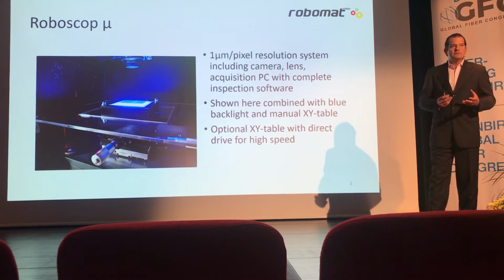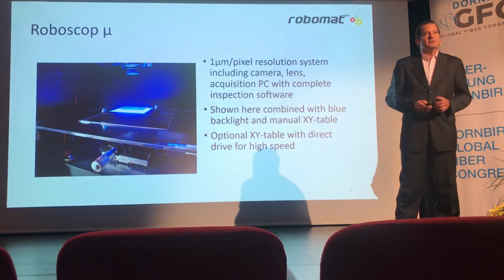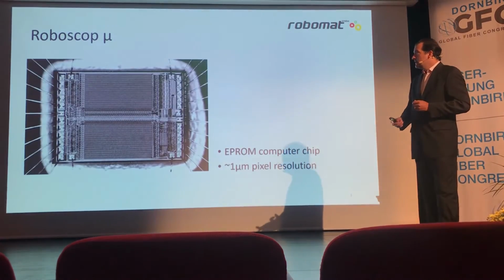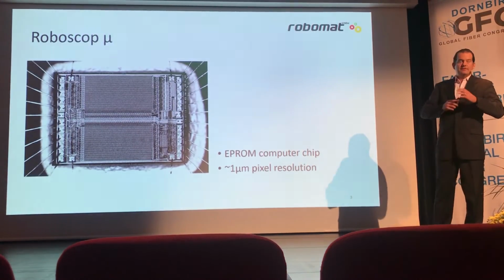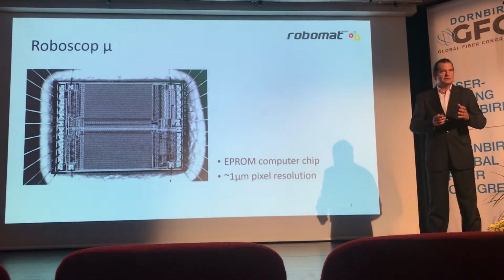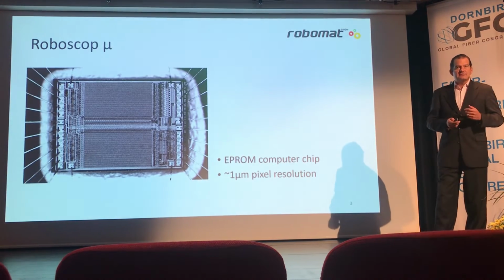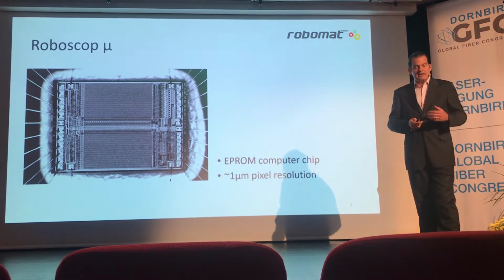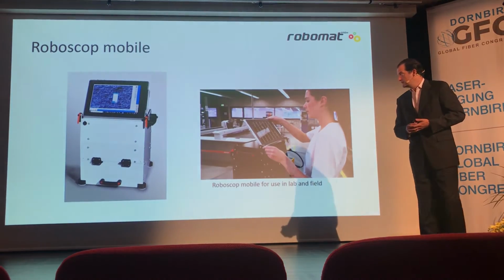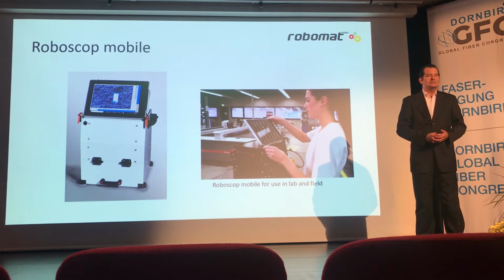That's a very important number because, of course, the pixel is the smallest possible resolution that we have in the digital imagery. We are working with very high-performing chips, very high-performing computers, because the amount of data that we are generating through this high-resolution imagery is very high, and we have to make sure that we can keep in the processing times.